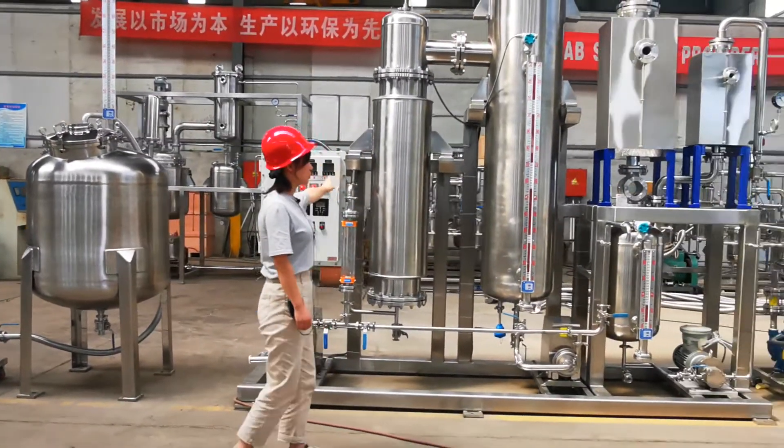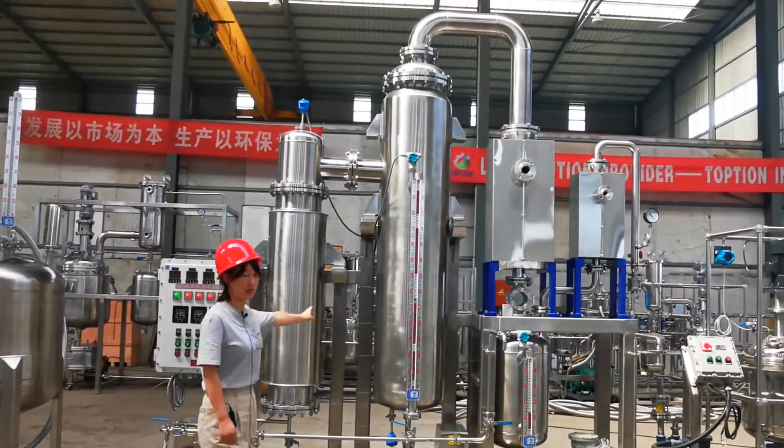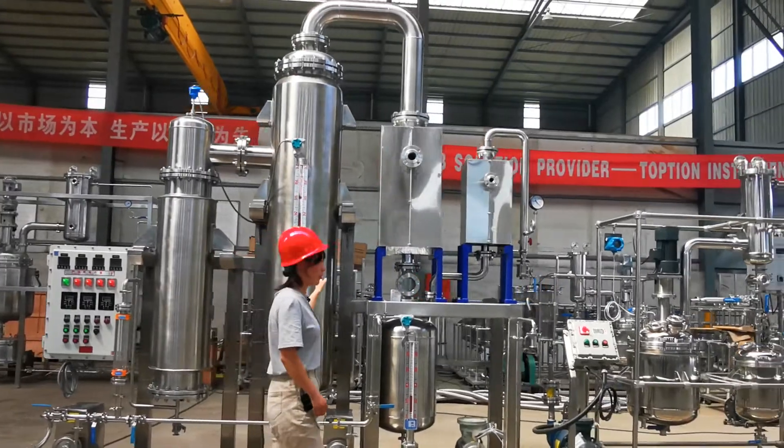We will use the thin film evaporator during the solvent recovery. It's a thin film evaporator.